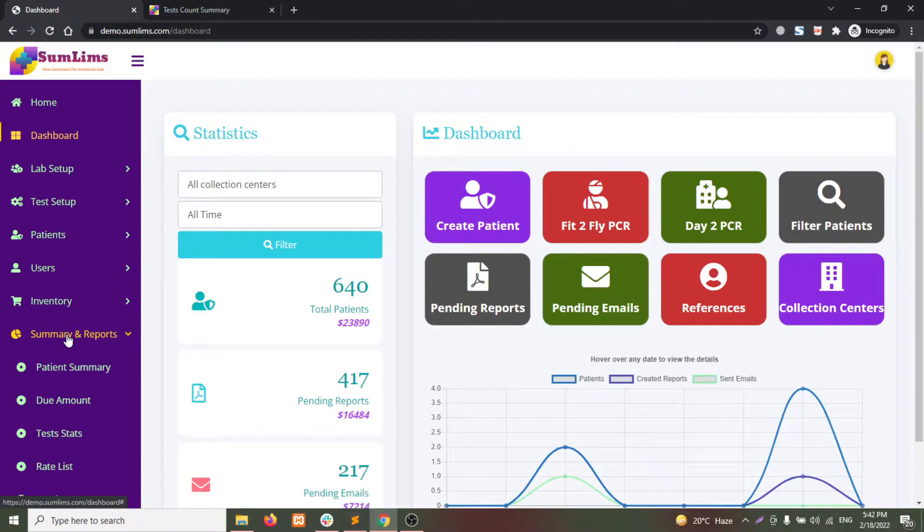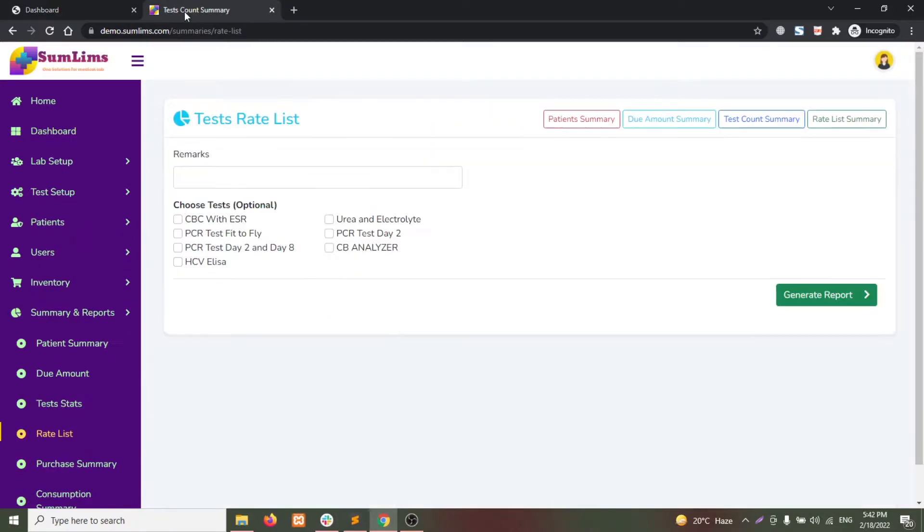Click on summary and reports and then go to the lab rate list. Once the page is opened, you can click on generate report.